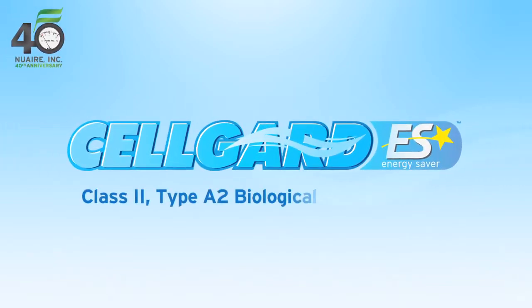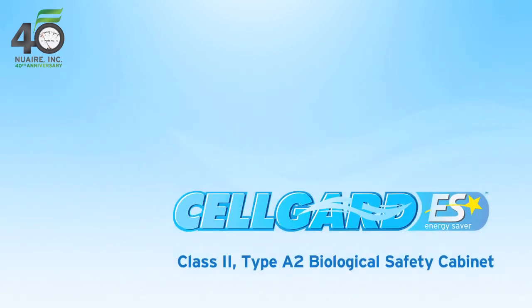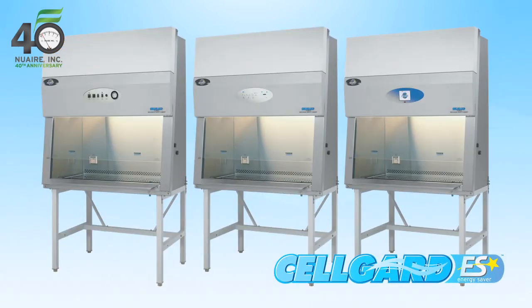The all-new CellGuard Energy Saver line of Class 2 Type A2 biological safety cabinets features three models in four different sizes that provide cost-saving technologies while enhancing user, product, and environmental protection.